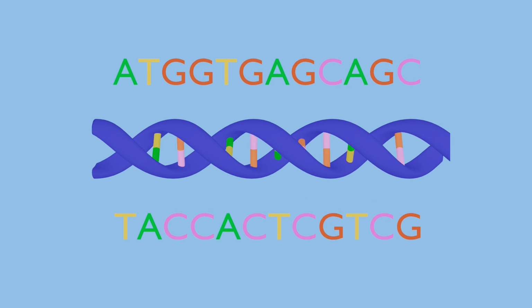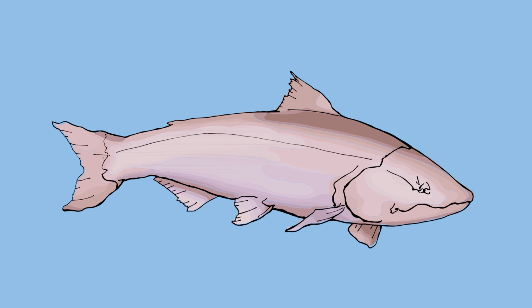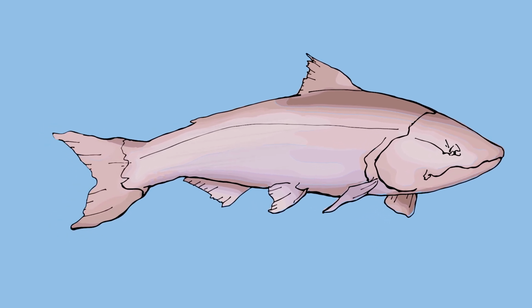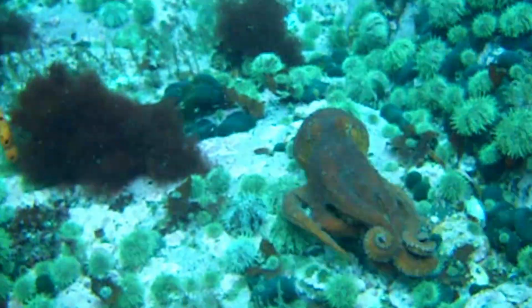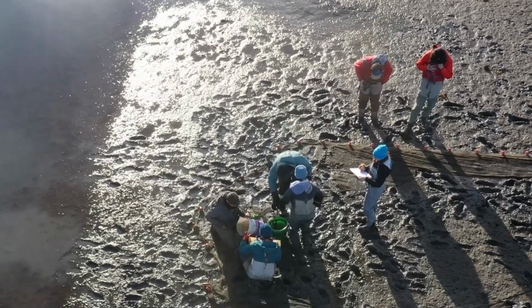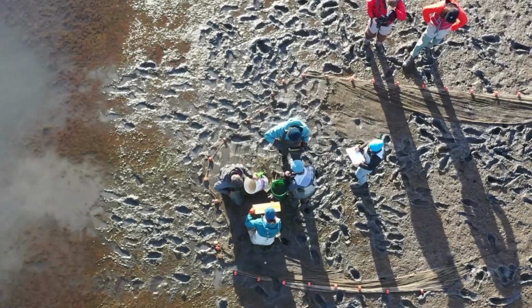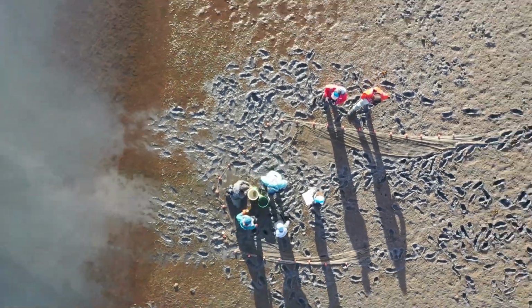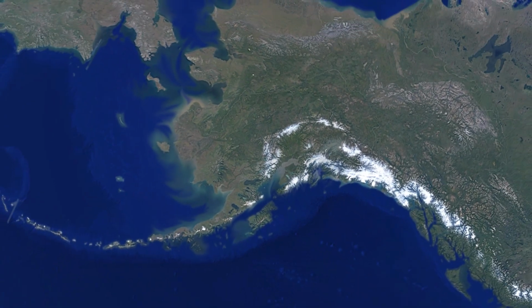The scale of this project is really cool because we are analyzing tiny segments of DNA that we collect from the water, and those segments of DNA represent a ton of different organisms across the whole tree of life, from fishes to invertebrates to algae and even mammals and seabirds. And so by piecing together all of these tiny fragments that we actually can't see with our own eyes, we can answer these really big picture questions on how entire communities and ecosystems are changing across these glacial gradients.